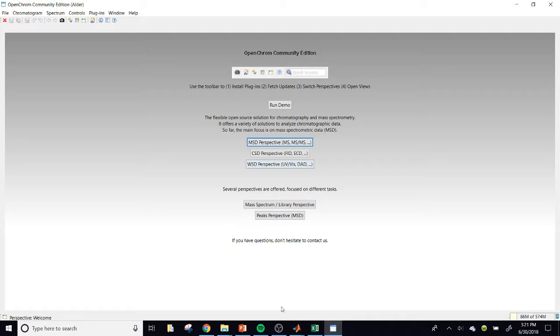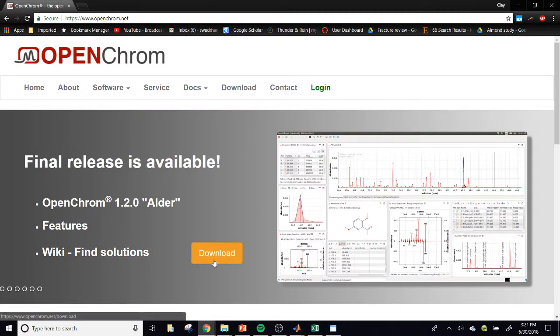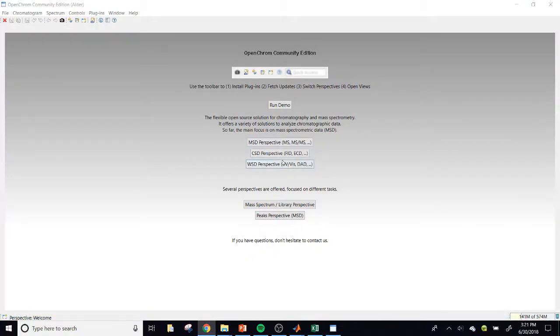I'll show you where to find that. I'm going to try and keep this video really short. All we're going to do is convert the file, because in my last video I went into how to convert the file, but also how to deal with things like redrawing the chromatogram and manipulating the graphics in MATLAB and Excel. I'm going to assume you know how to do that or have a way to do that yourself.